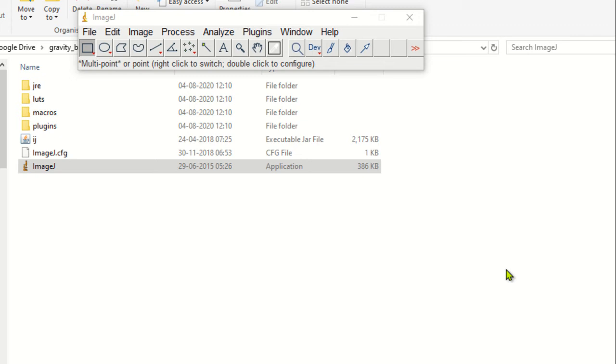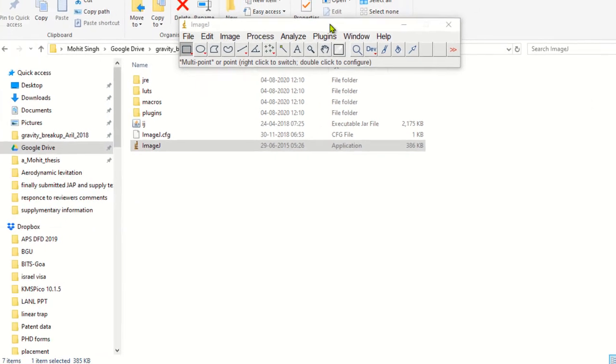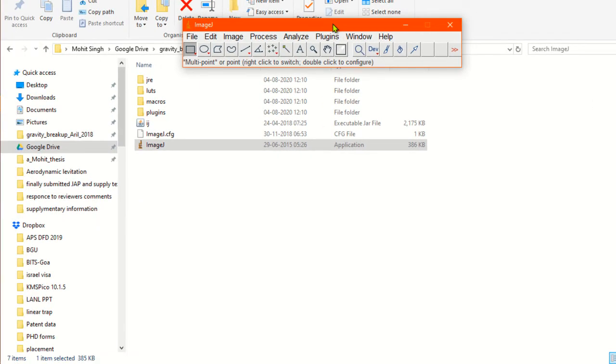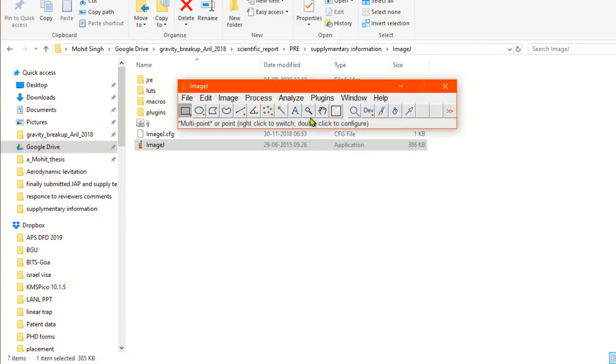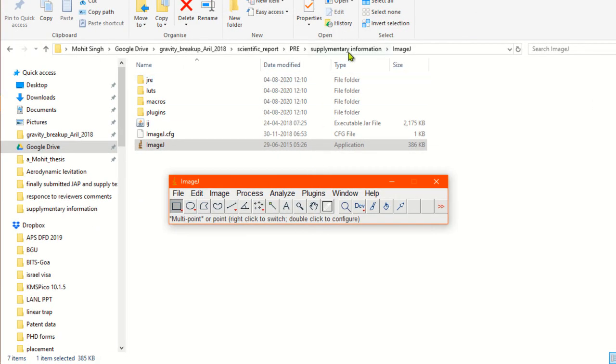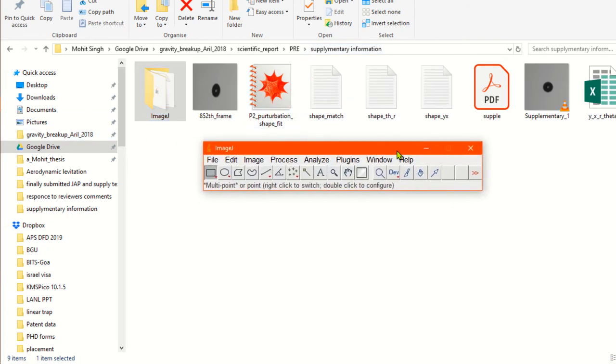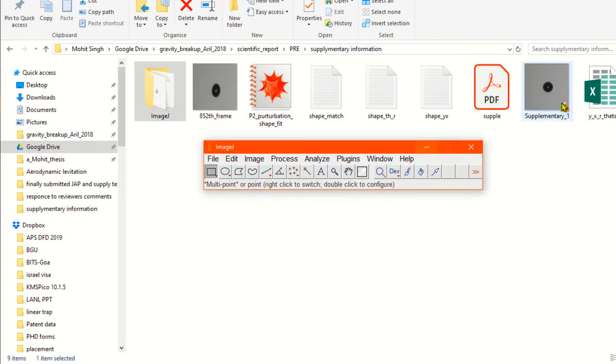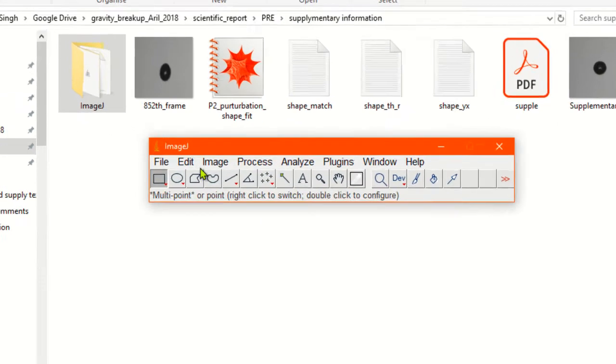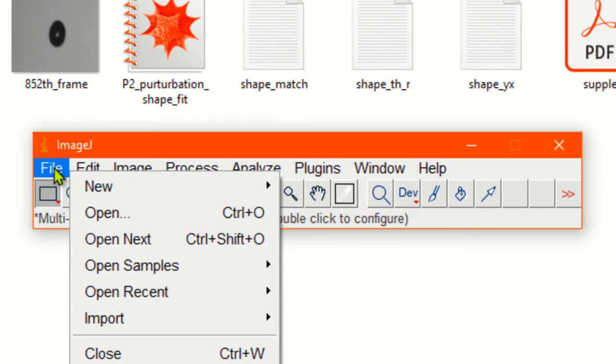The second video will be on manually finding out the various Legendre coefficients, and the third part will be on automatic fitting method. Alright, so let's start. This is ImageJ.